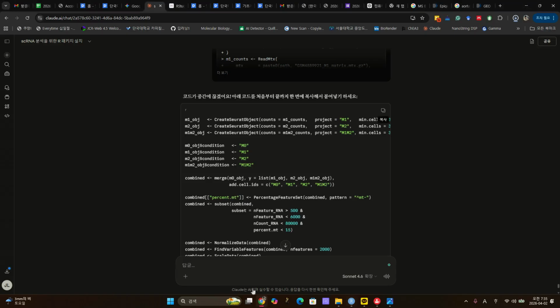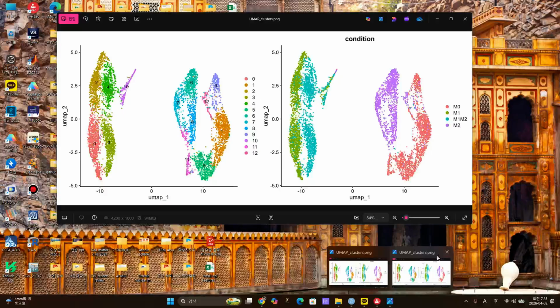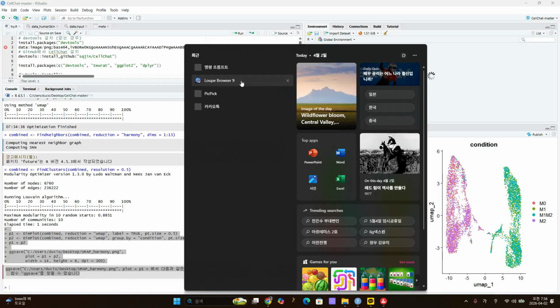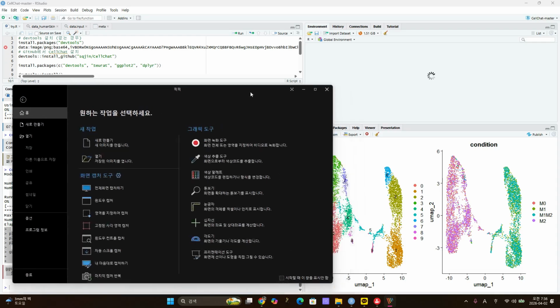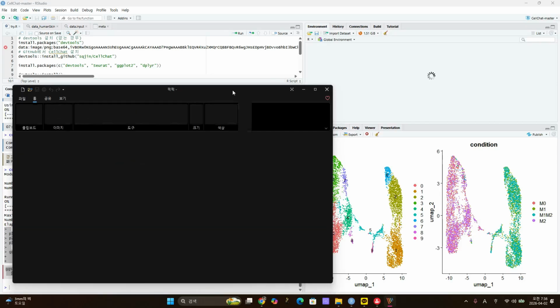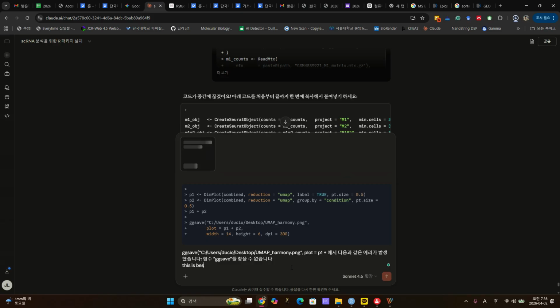Copy this one. Capture. Yes, after Harmony.